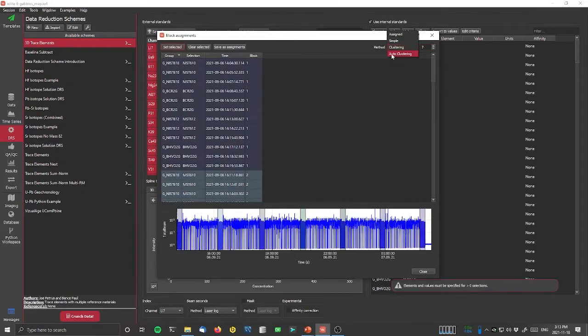We also have an auto clustering approach. If you do click this, it will take a little time to run because it's automatically running a lot of calculations to try and work out what the optimum number of clusters are. And it will work, but it just takes a little bit of time, and it will basically find 7 as well here. In this case, it works fine to use simple.